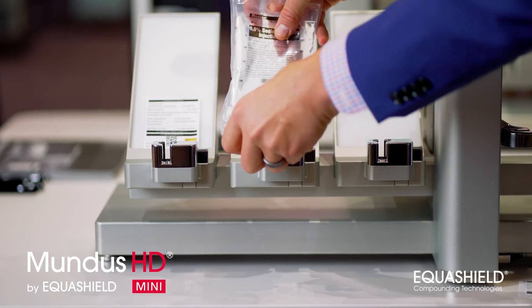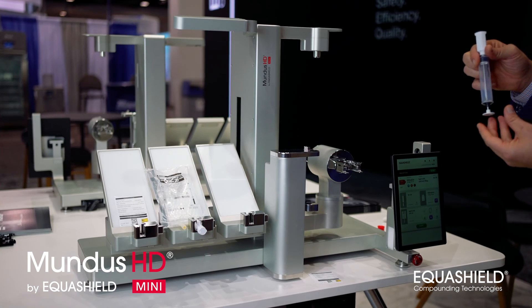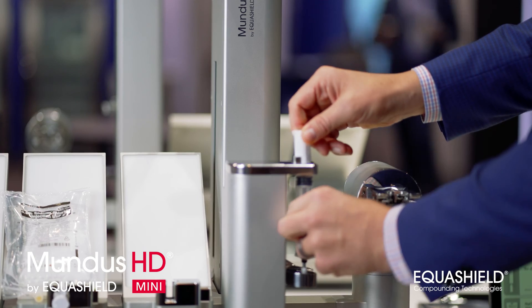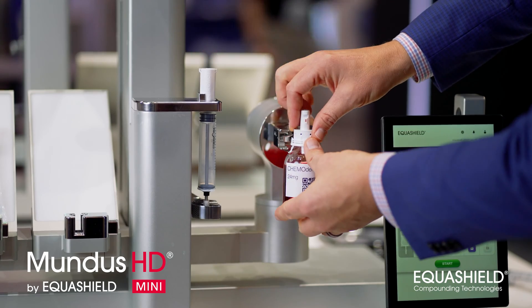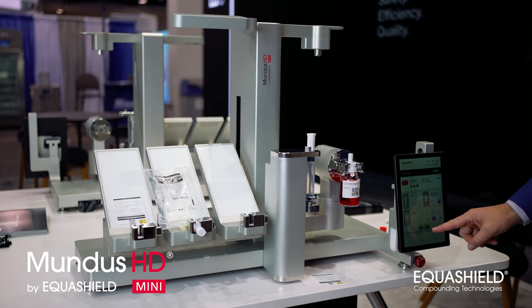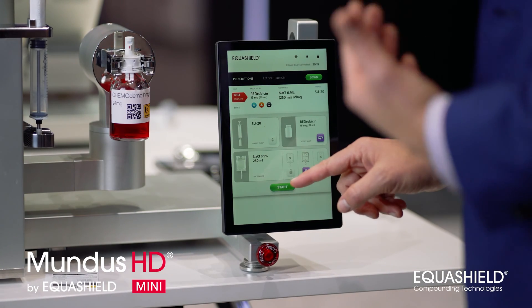I'm going to load the IV bag into its spot and lock it in place. I'm going to take my 20 ml syringe and place it into the syringe pump. Next I will take the drug with the vial adapter and slide it into place. Once everything is in its position, I will hit start on the screen and now Equishield Mundus Mini HD will do the rest.